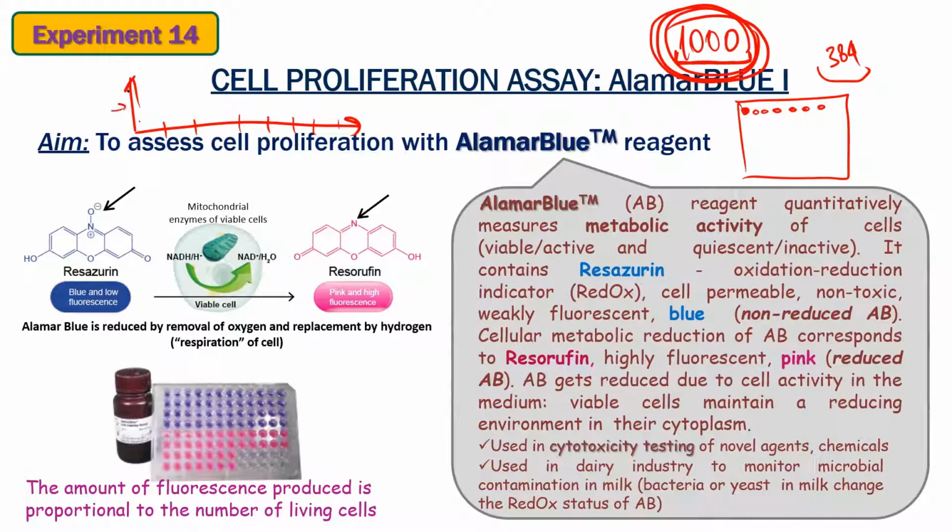So here we would have the number of cells, and of course, we plot it. We know that we were seeding, let's say, 10,000. And if the graph just goes like this, of course, at this point, or even this point, we have cell death. In this case, we know that this particular drug, which is the first, is not okay just because it starts killing cells 3 hours after addition. For some of these graphs, you will have just a straight line, and of course, it means that it is okay for this particular cell type.